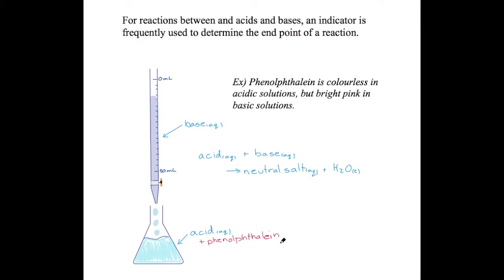But here's where it gets interesting. With that first teeny tiny fraction of a drop that's being added to the acid that is in excess, what it's going to do is turn our entire solution strongly basic. And that will be shown visually by this solution turning this bright pink color.